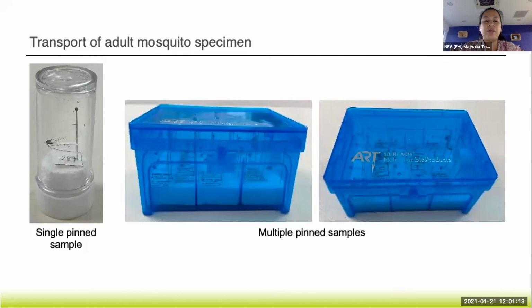These are actually reused filtered pipette tips, and we reuse them for temporary storage of pinned samples. And you can actually bring your samples using this method.